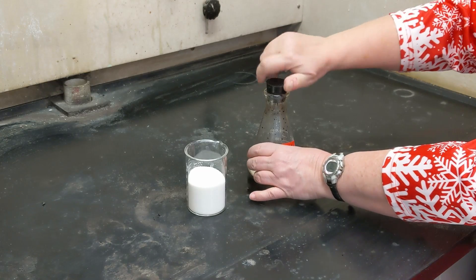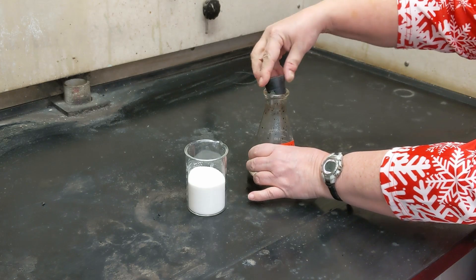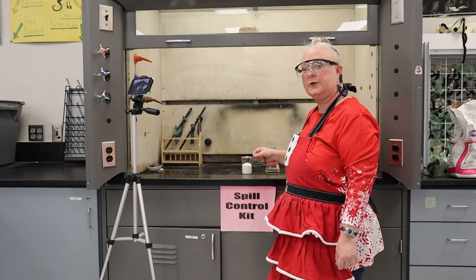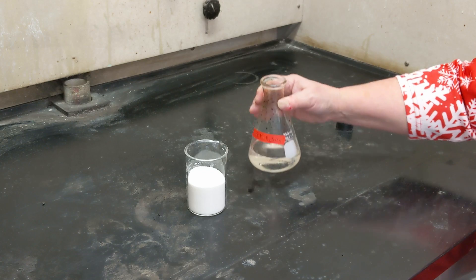This here is sulfuric acid. Sulfuric acid is a strong acid. You don't want to get this onto your hands. And what we're going to do is we're going to dehydrate the sugar. Dehydrate just means to take water off of something.